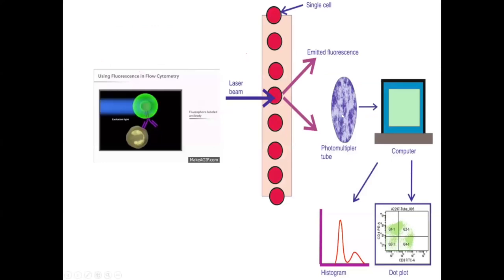The laser beam hits and the detector captures it, and all the analog to digital conversion, baseline processing, pulse generation, pulse processing, everything happens. And then what you see in the computer is the analysis. That's the sweetest part that people see, but people don't look at the rest. If anything goes wrong in this area, the analysis is absolutely useless. So you should know all these things before you go to the analysis part.